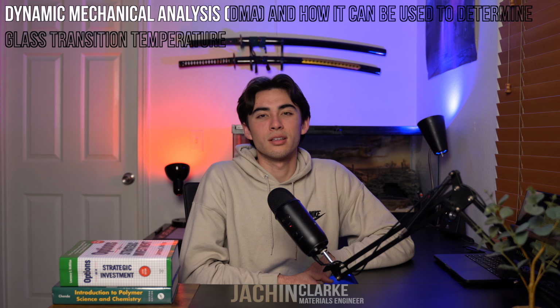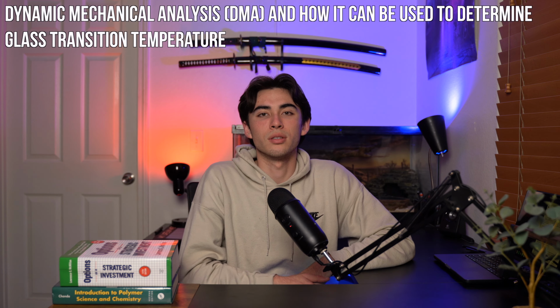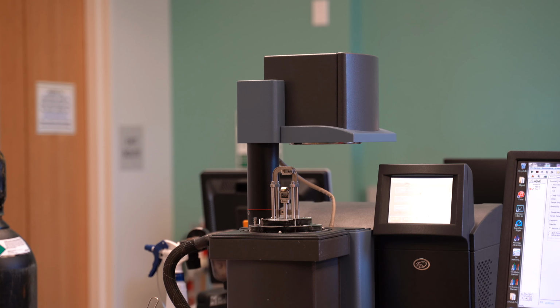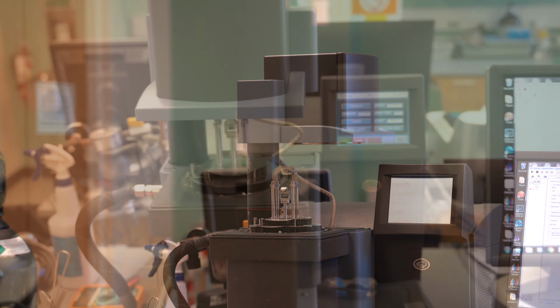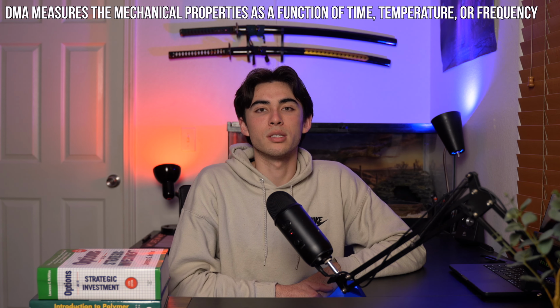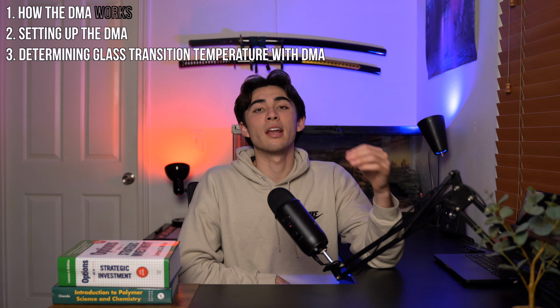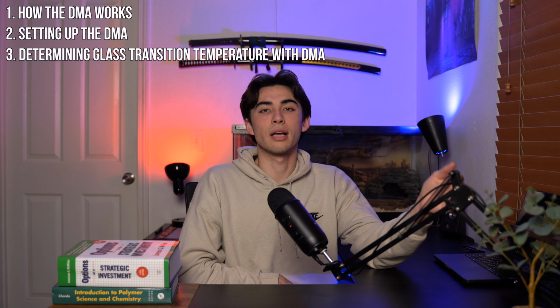In today's video, we will be discussing dynamic mechanical analysis, or DMA, and how it can be used to determine glass transition temperature. Dynamic mechanical analysis is one of the popular techniques that can be used to study the viscoelastic behavior of polymers. DMA measures the mechanical properties of polymers as a function of time, temperature, or frequency. By the end of this video, you should understand the basics of how the DMA works, how to set up the DMA, and how to analyze data to determine the glass transition temperature. Let's get started.